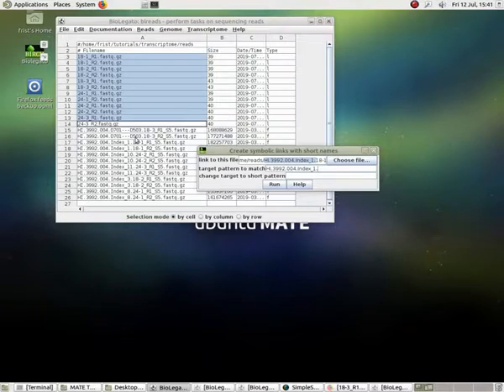So at the bottom here you can see that we have Illumina forward and reverse read files with these very incomprehensible names, and one of the tools in BL Reads, which is the BioLegato application for working with sequencing reads, is simply to create symbolic links to the original files with shorter names.